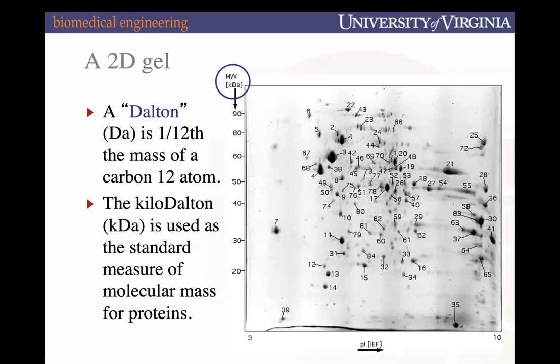I was answering a question earlier where when you're running your gel, there's a buffer that allows you to see your sample running down. But after it goes all the way through, your native gel looks blank. Once you apply some sort of stain like Coomassie blue, then you can see all of the proteins.